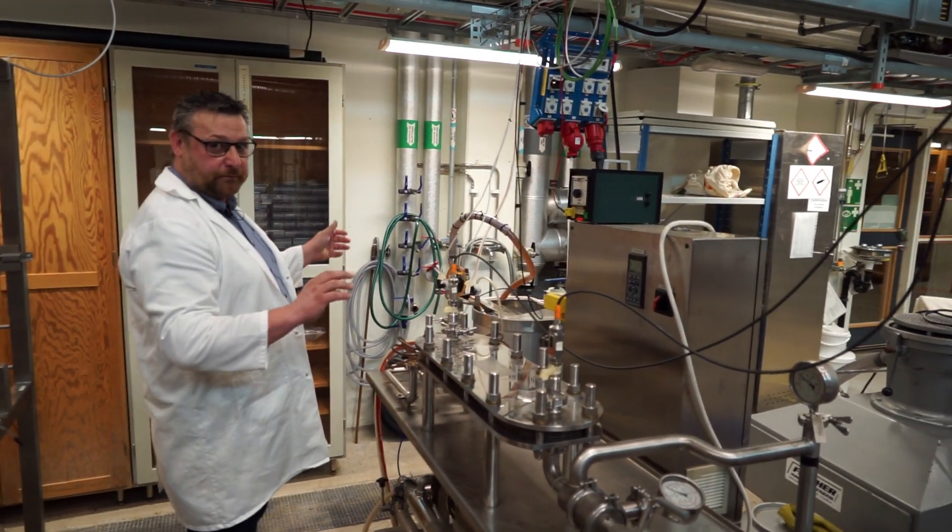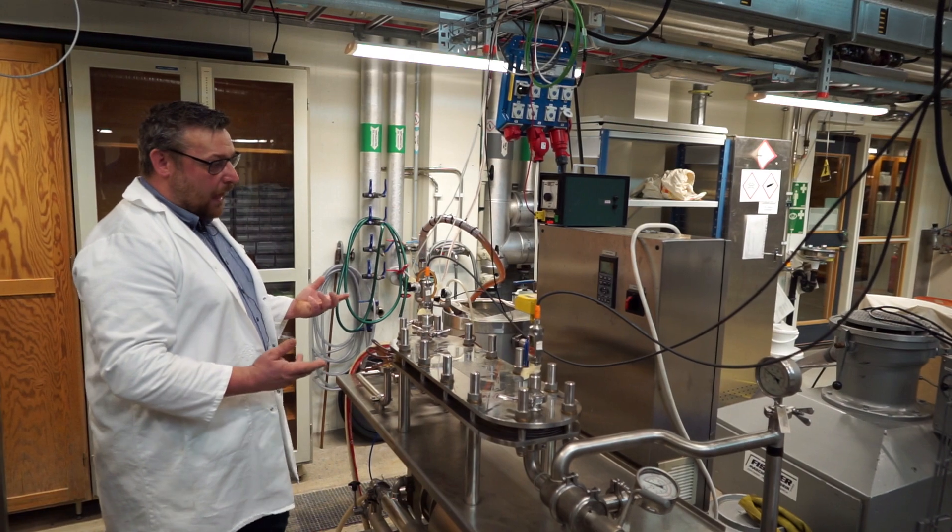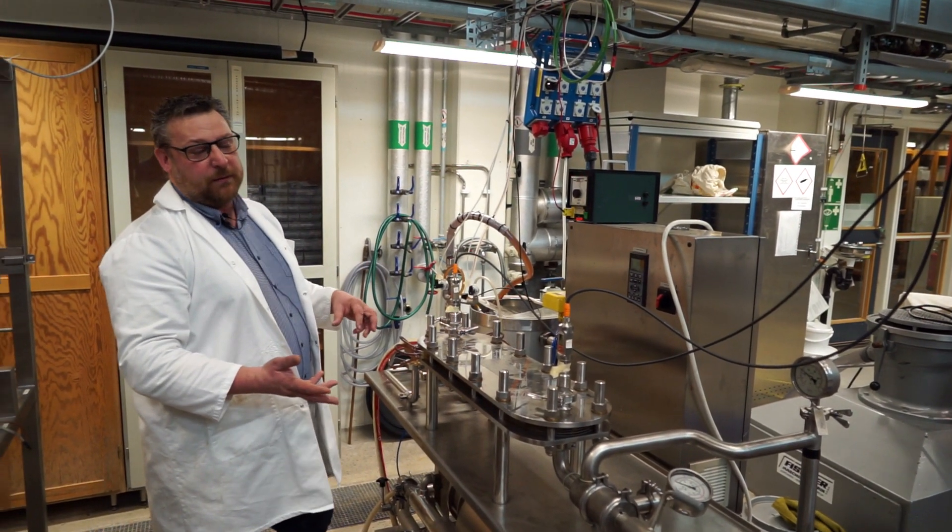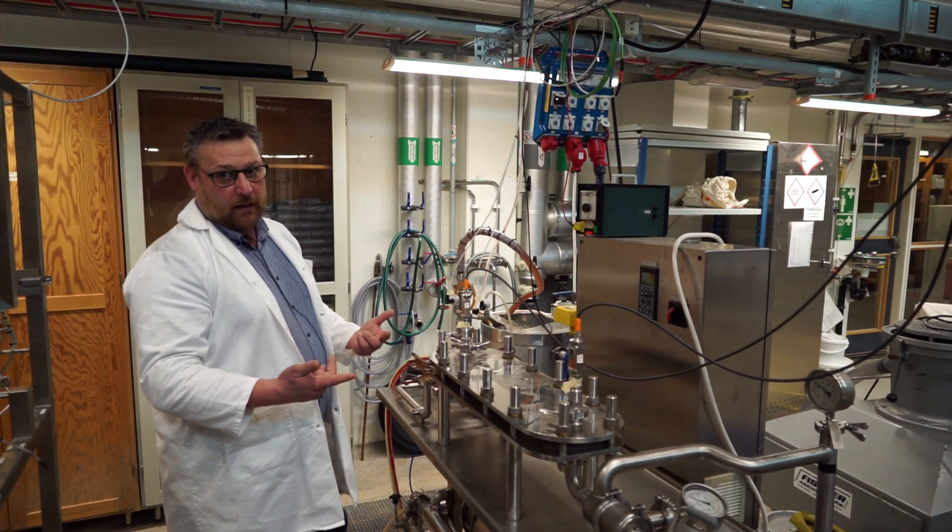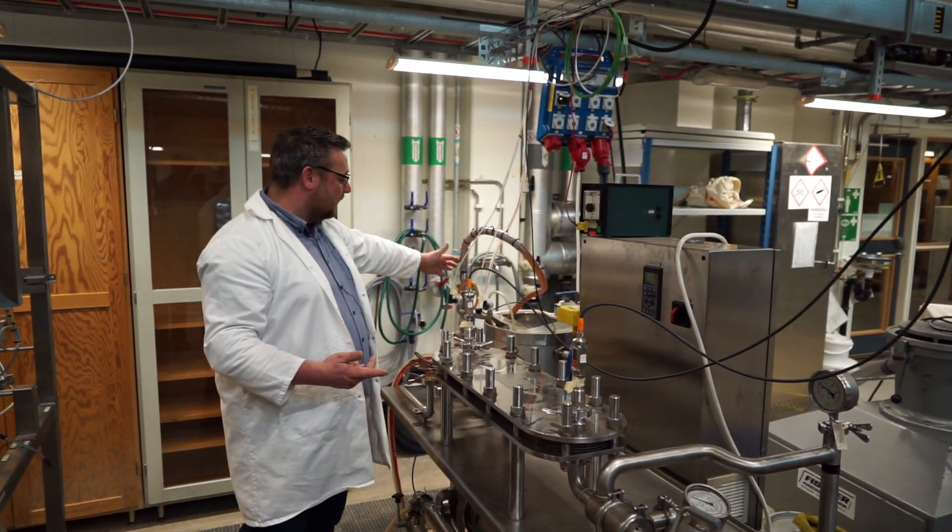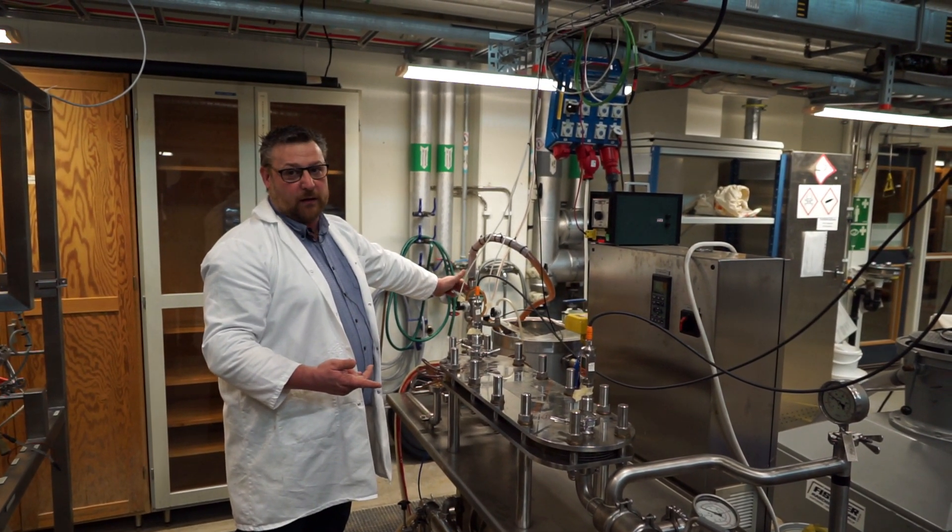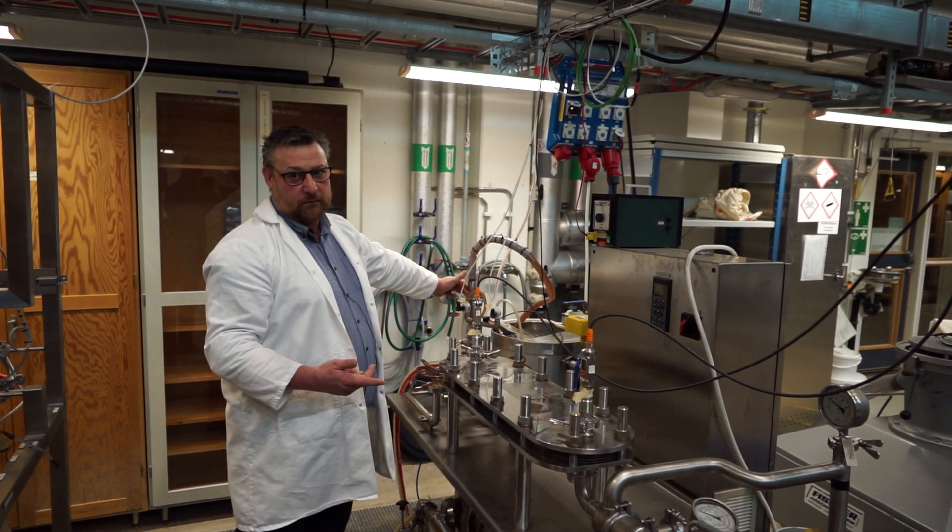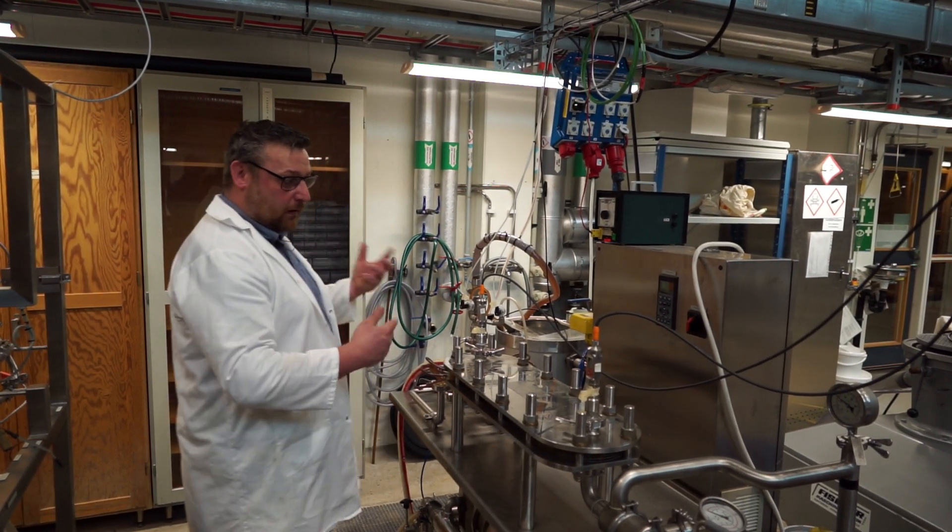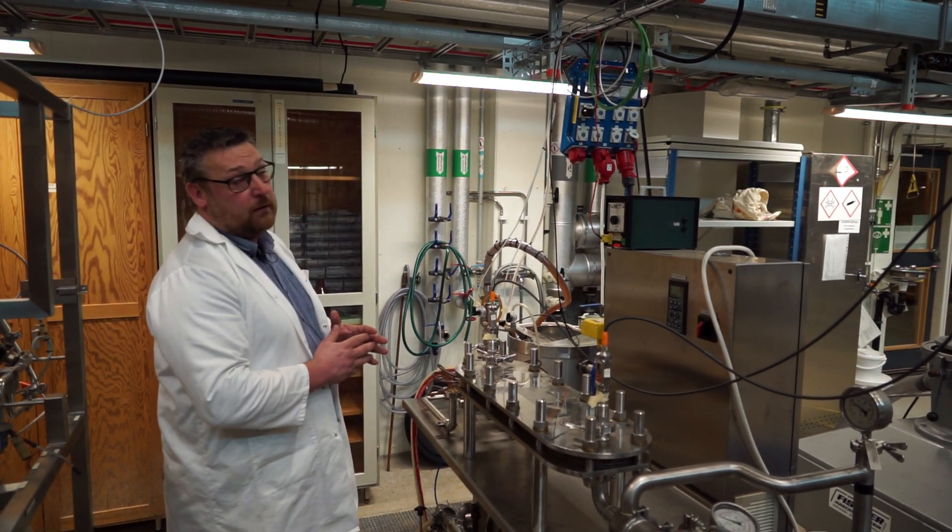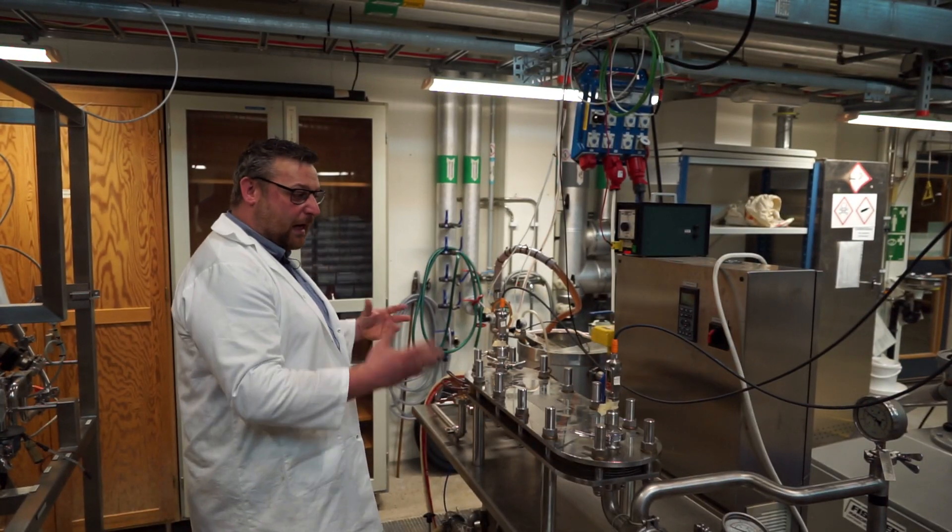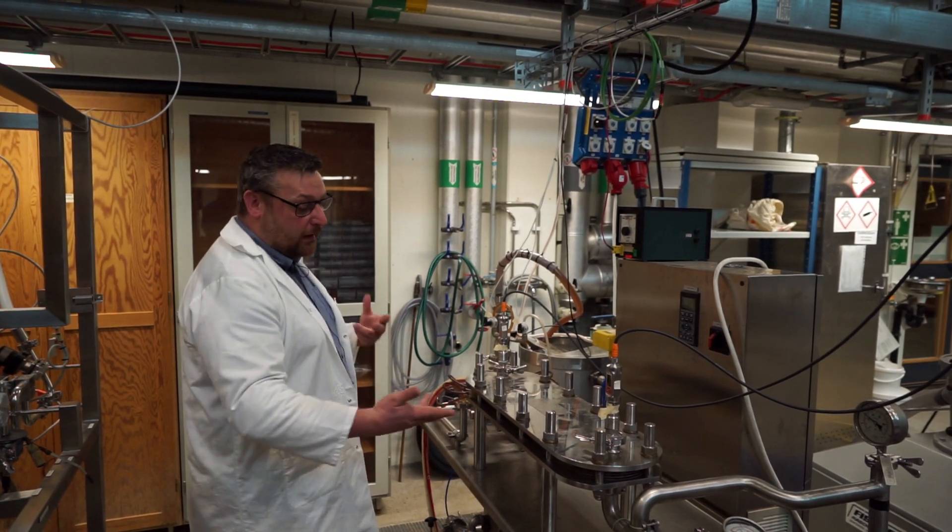Are there other pumps you can use to make it easier? Had we had a displacement pump instead, that would always give the same flow. And then I would just control the pressure with the retentate valve. So, a centrifugal pump or a displacement pump behaves differently also in the membrane system.